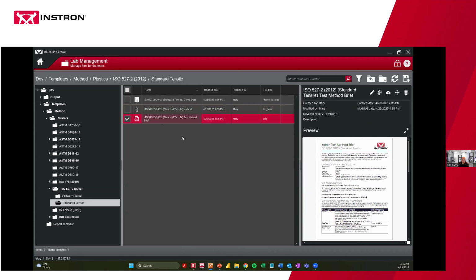So this is, of course, accessible in Universal, but if you want to upload it into Central, you can view it here.